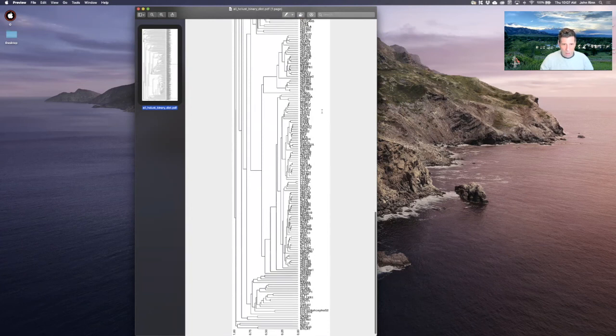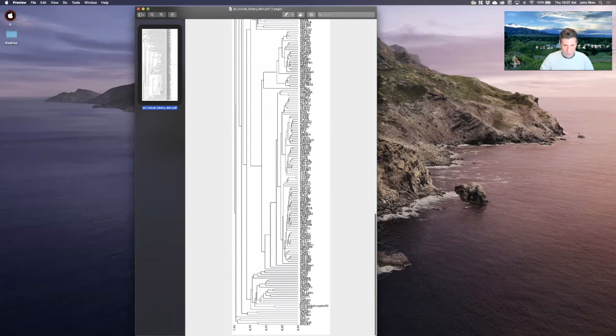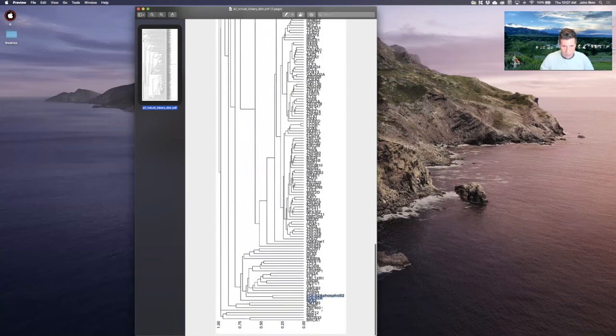This is incredible. And so let's zoom in down here where we have this Pol2 phospho2, which is this sort of polymerase running along the gene. And interestingly enough, we see that the other Pol2 subunit, which was a completely independent ChIP, independent of the phosphorylation state, is right here with it. So that's a good sign. And this is why I was excited for today, because we actually didn't know if any of this data made any sense.